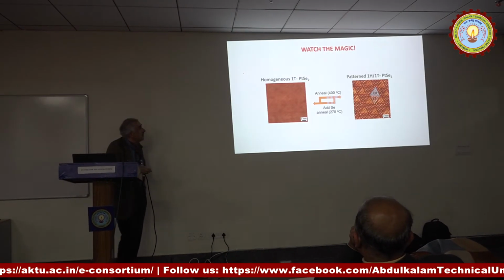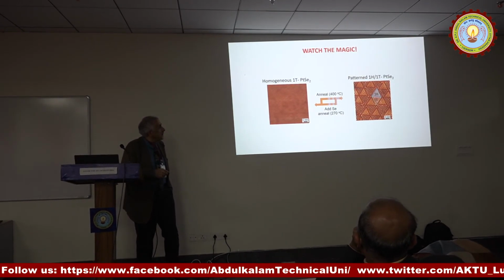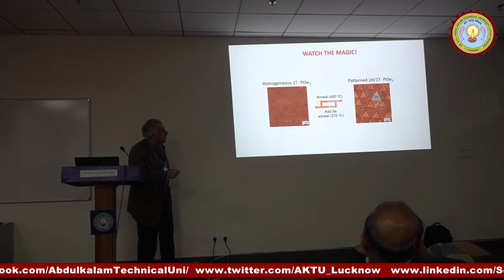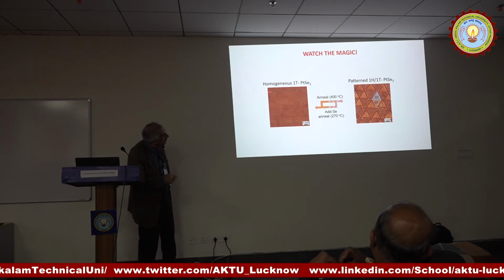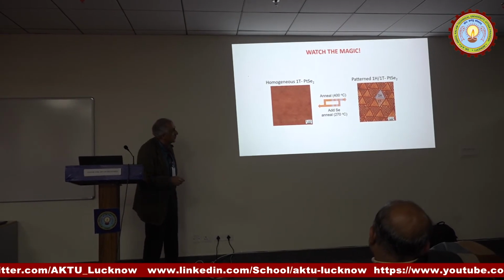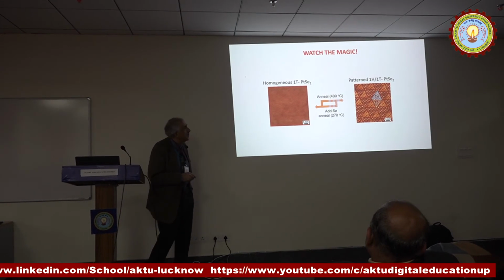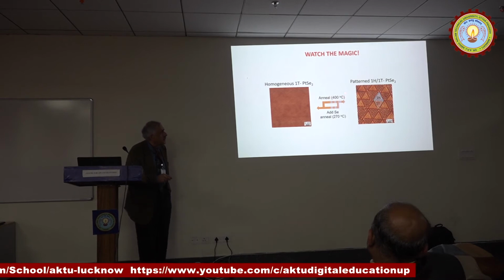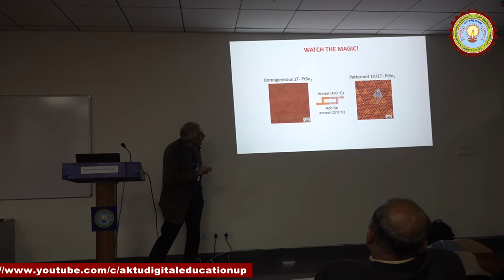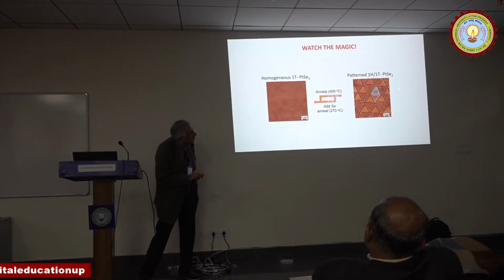But then we did something more clever. With magic, as my friends in Beijing know how to do really magic. If you start with homogeneous PtSe2, which is what we have, you can see how beautiful it is, on the scale of nanometers. And anneal it at 400, and you might say, why 400? Because they played for a while and tried different temperatures and got interesting things until they zeroed in on a certain annealing process which gave them these beautiful triangles.